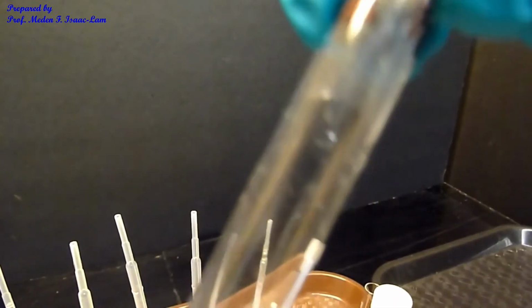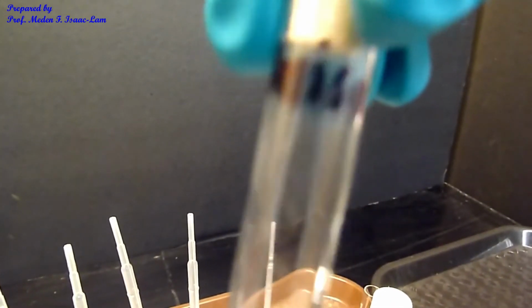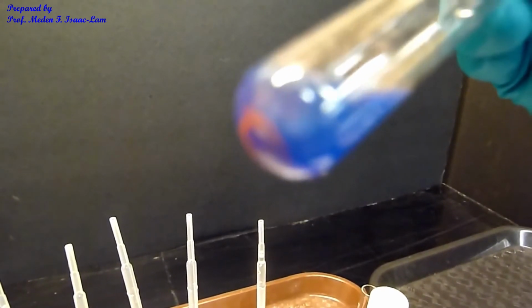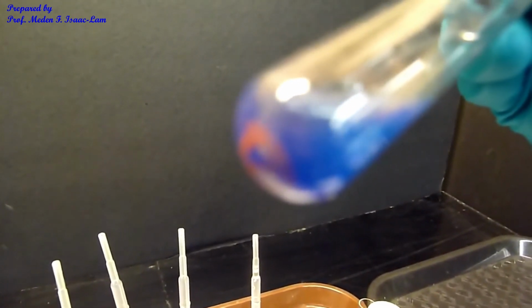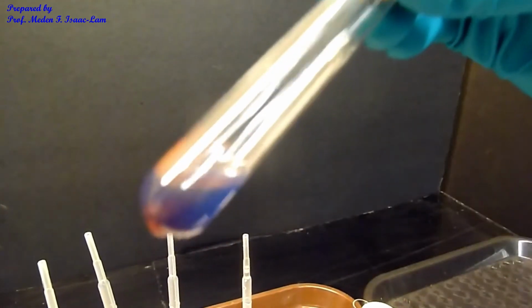So this is the anisaldehyde standard, and that's the color of copper(I) oxide at the bottom. So again, F has the red precipitate at the bottom.